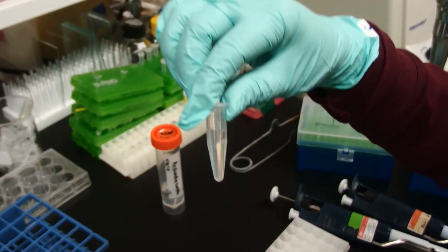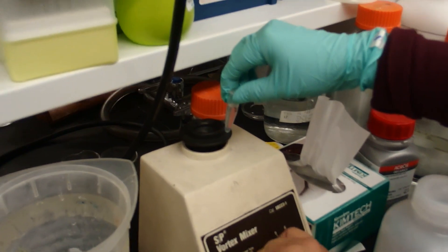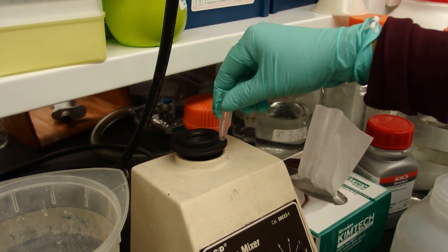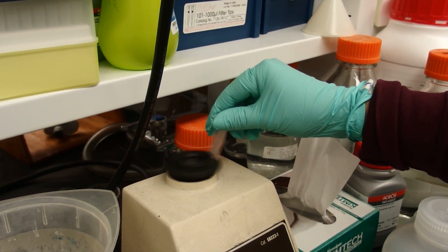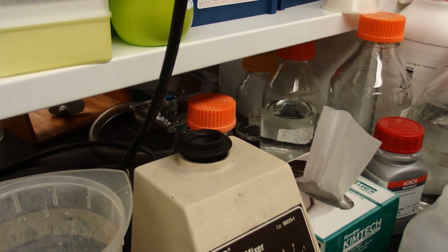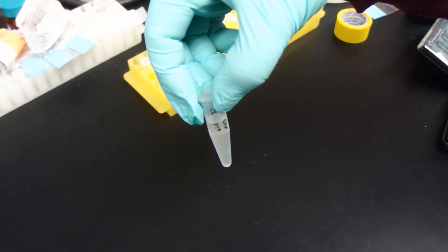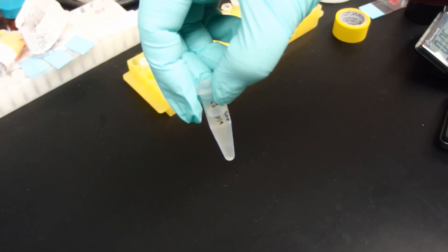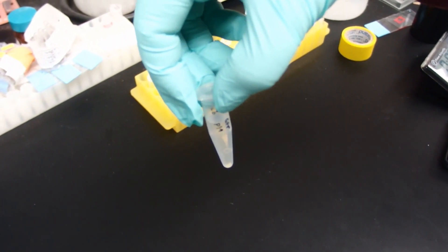We are going to vortex now. The pellet is not so much, so it is already re-suspended. Our culture is already homogenized in the activation buffer and now we are going to incubate this culture at room temperature in the dark for 30 minutes to 2 hours. Then we are going to be ready to infiltrate this into our tobacco plant.